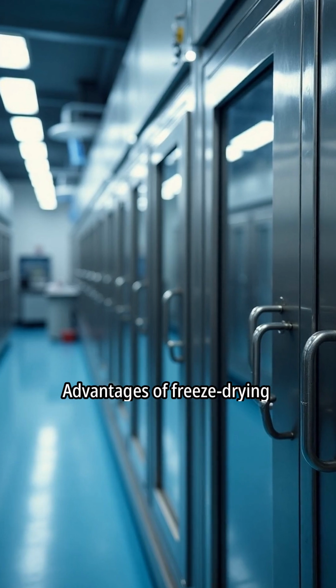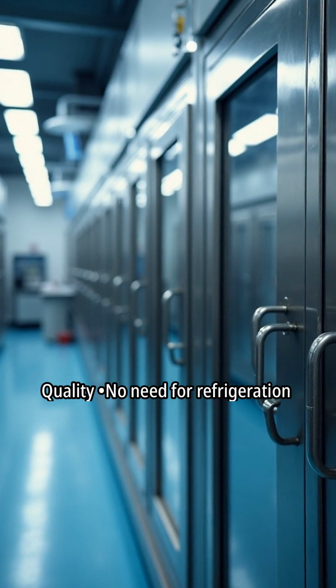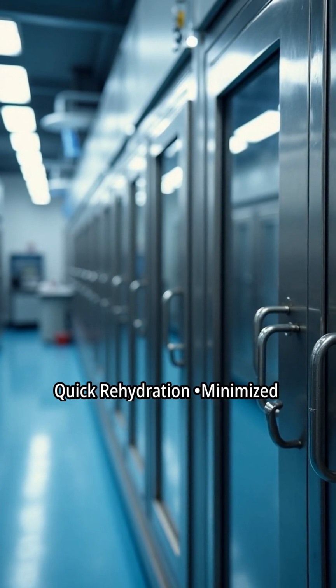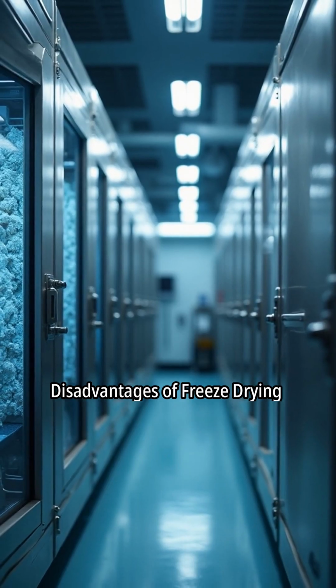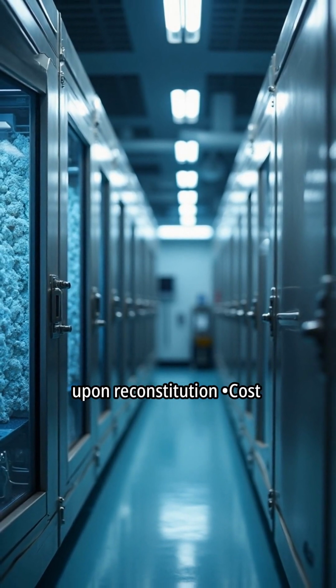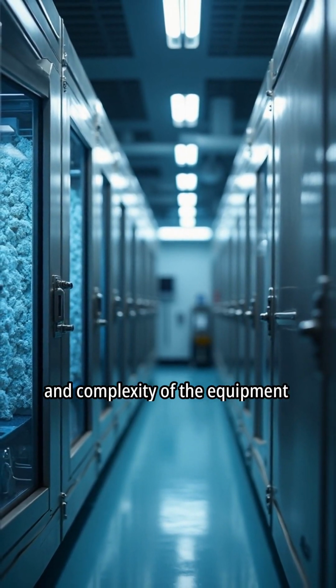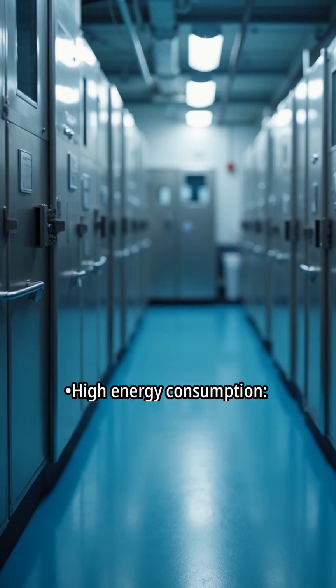Advantages of freeze drying: preservation of quality without spoiling, maintained quality, no need for refrigeration, quick rehydration, minimized risk of contamination. Disadvantages of freeze drying: increased handling and processing time, need for a sterile diluent upon reconstitution, cost and complexity of the equipment. Challenges in the freeze dryer: high energy consumption.